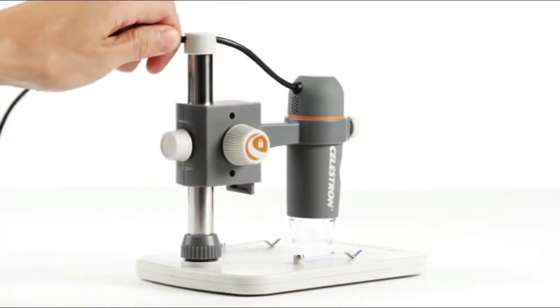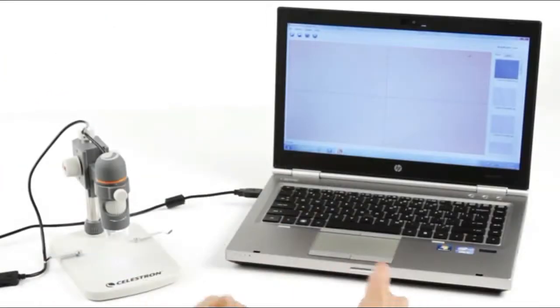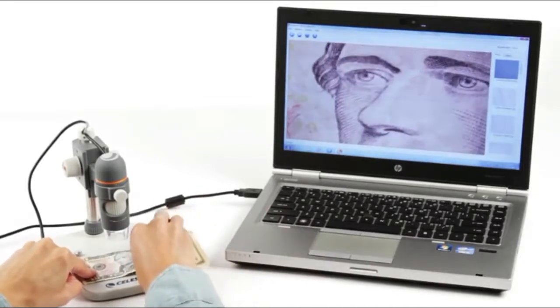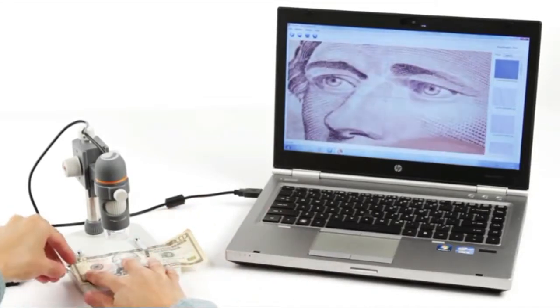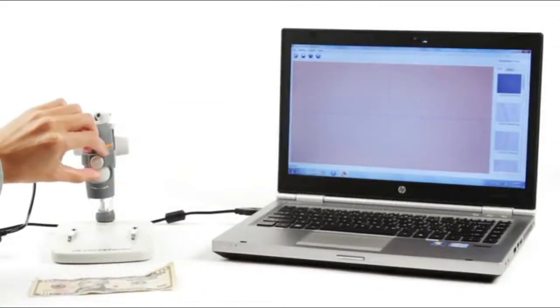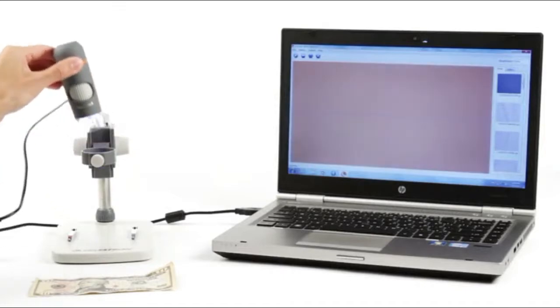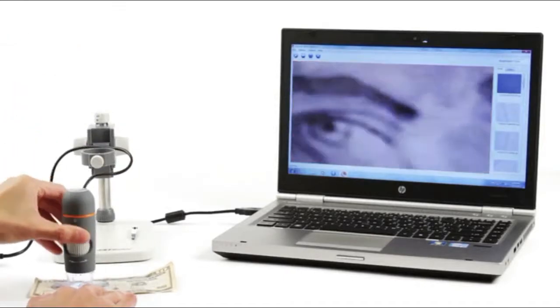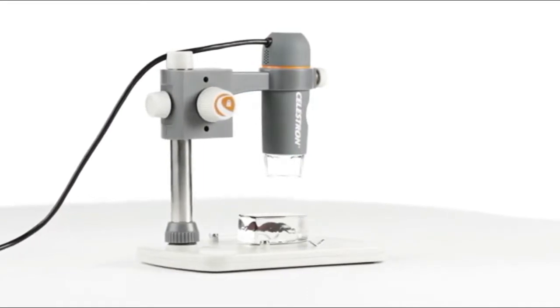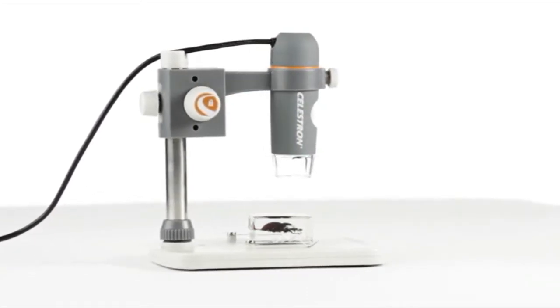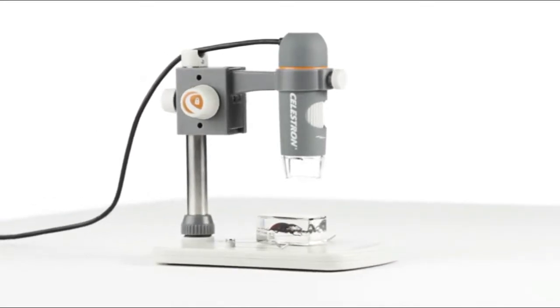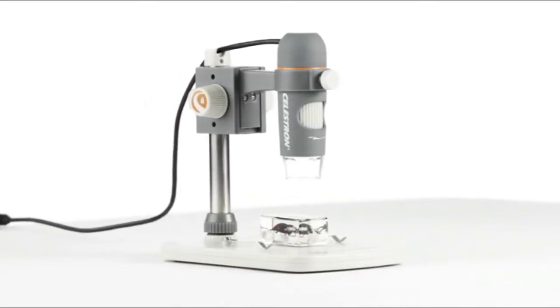The stand's stage provides the perfect platform for your specimens and include metal clips for anchoring flat objects like paper documents and stamps. The microscope smoothly detaches from the stand so you can use it in the handheld mode for closer views of your specimens. For high-quality views and recordings of your specimens from the workplace to the classroom, you can't beat the versatility, quality, and ease of use of the 5 megapixel handheld digital microscope Pro from Celestron.